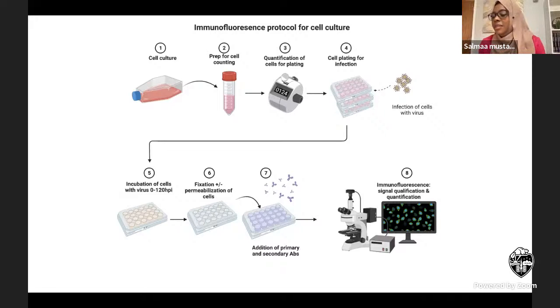Yeah, that's actually a good point, because different cells have different shapes and sizes. It's just like different gumballs of bubble gum. Maybe 20 will fit in this box and only 10 will fit in this box. So it's different.